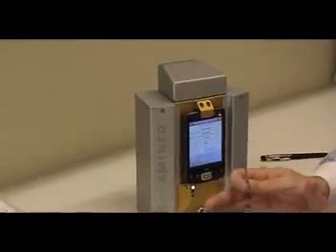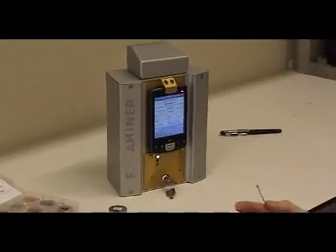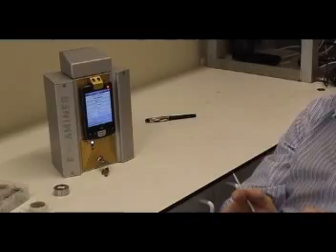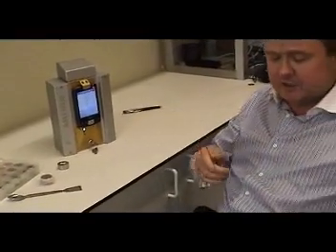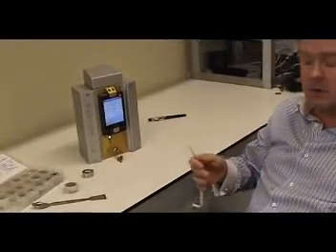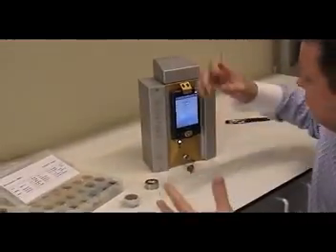But let's first do a demonstration for you. As I told you before, I'm just the president of Applitech. I just have been trained. I have no scientific background, but I will do a demonstration. So normally when you take this instrument to the field, you can carry it to the field. You can use the straps to hold it around your shoulder. You can use our rugged baggage to put it in. You can take it to the field, or you can do that already at home or in the lab.